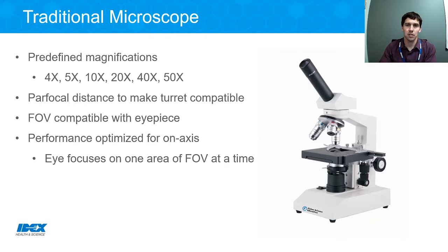These standards are used here, but also throughout the optical microscopy world, and are based on Royal Microscopical Society standards originated in the 1890s. This sizing standard puts a hard limit on objective sizing and still to this day can lead to resolution and field of view being constrained. Another aspect of these objectives is that as the eye was the primary detector available at the time, and the stage could be moved to bring the item of interest directly to the center of field of view, the only portion of the lens that was fully diffraction limited was a limited field of view around the on-axis point.